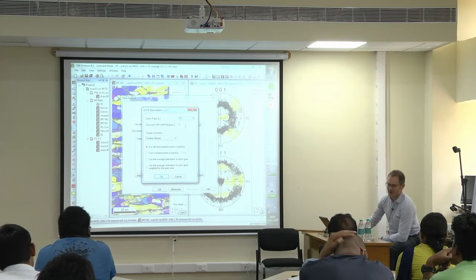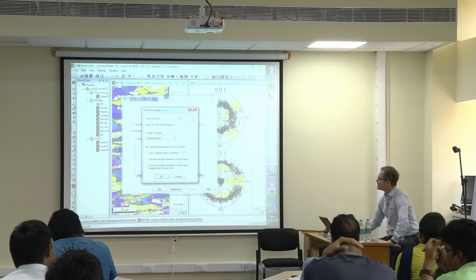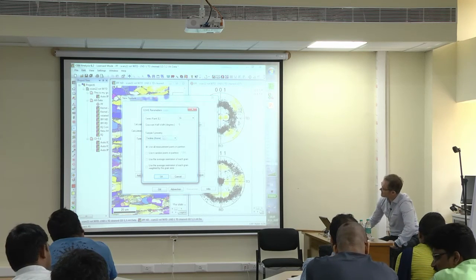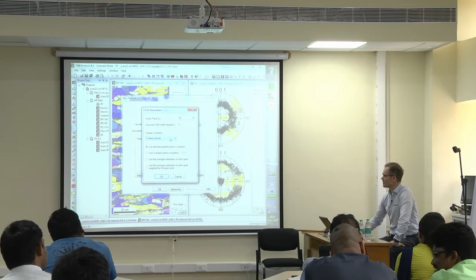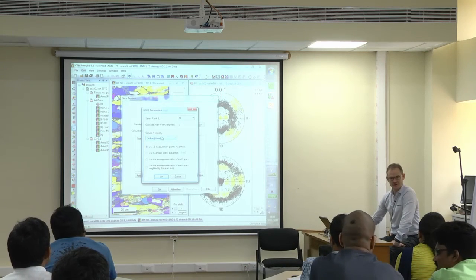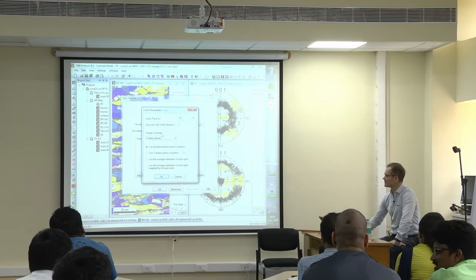And then the Gaussian half widths for how you spread out your individual peaks. And then what I have nerved you with, where I was a pain in your neck, sample symmetry. No? You can actually enforce sample symmetry.